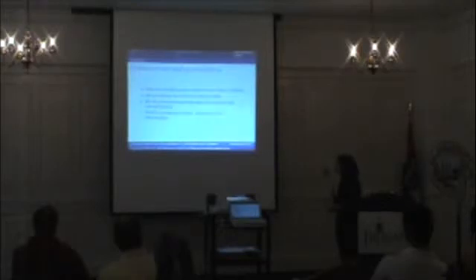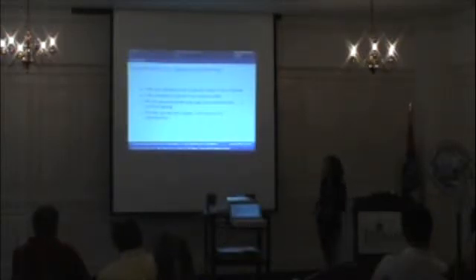So when we look at segmentation problems, you have to look at what images you need to segment, because every segmentation problem is different for each image. So O's group has very different images than we do. They have a different approach for taking it. We have pictures of cells. They're pretty round, which is nice. It's good for segmentation. We like convex things. And they're individual units, so we don't want any overlap of the lines.